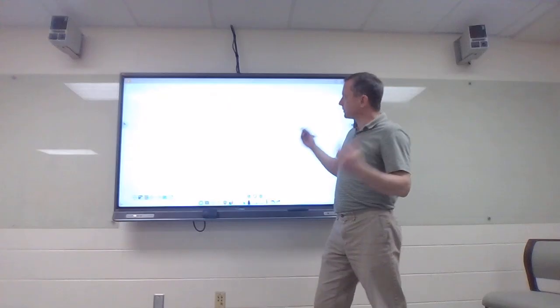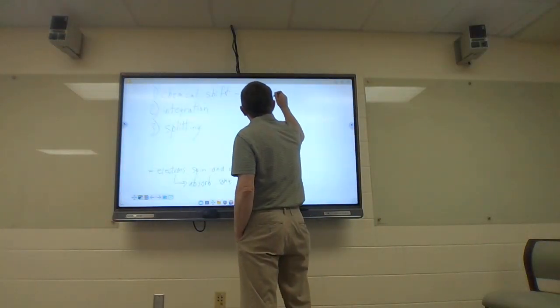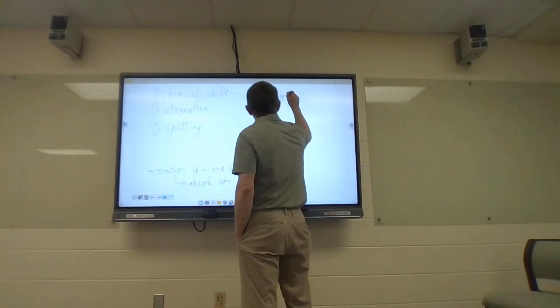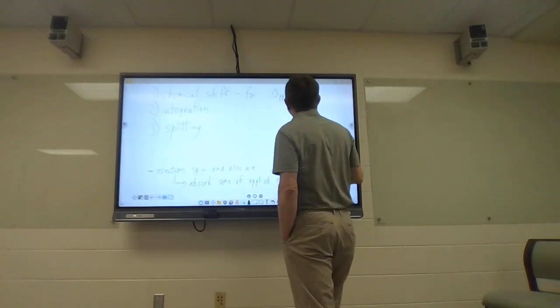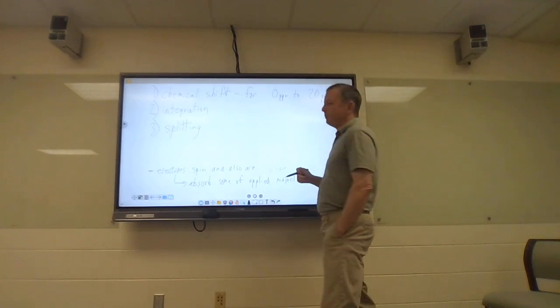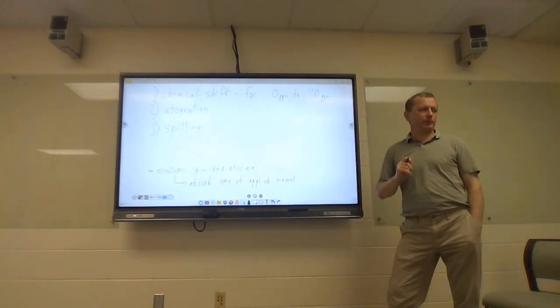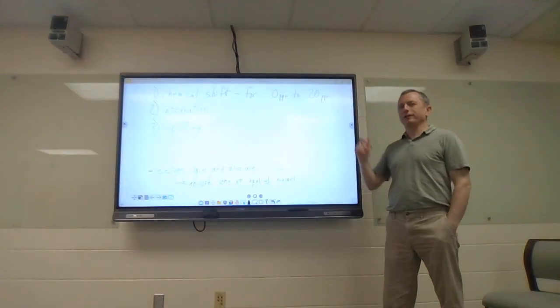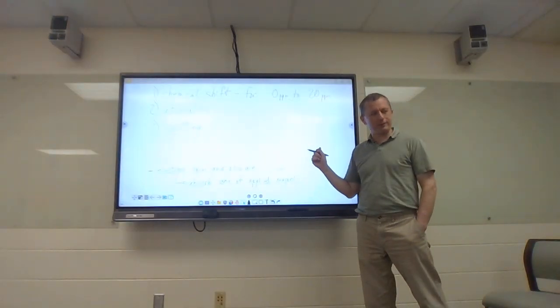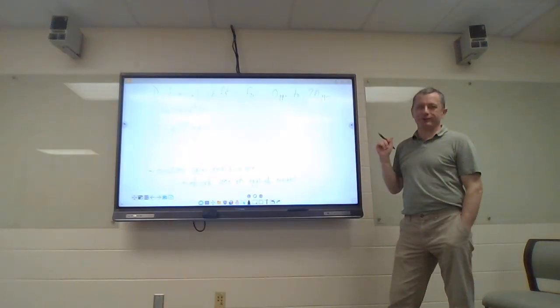So we're going to look at a spectrum for hydrogen, roughly 0 ppm to 20 ppm, but more often than not, we'll cut that off at about 10 because we really don't see a lot of useful protons. Most of the time, we don't see useful protons below 10.